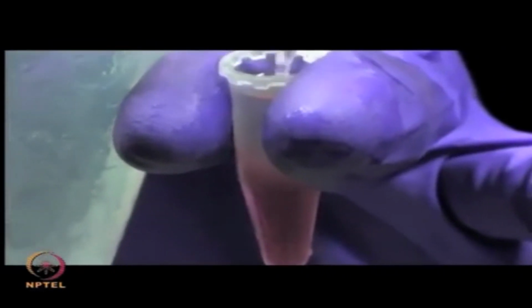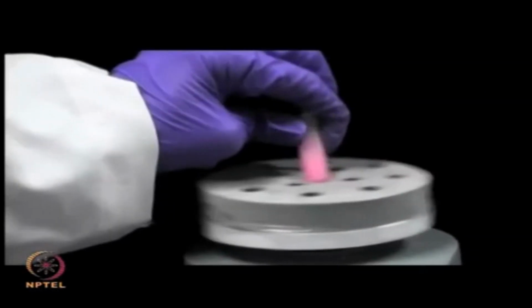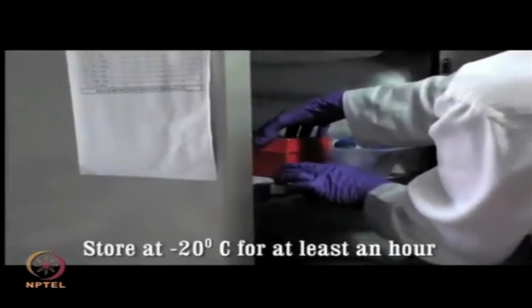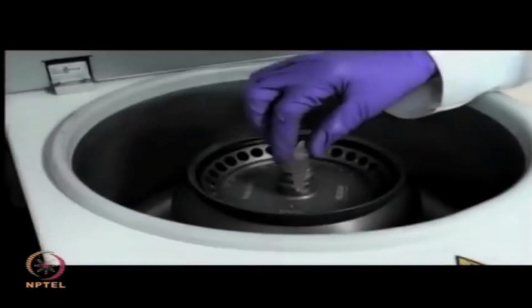Then add chilled acetone to this tube and mix well by vortexing. Store this solution at -20 degrees Celsius for at least an hour before centrifuging it to obtain the protein pellet.